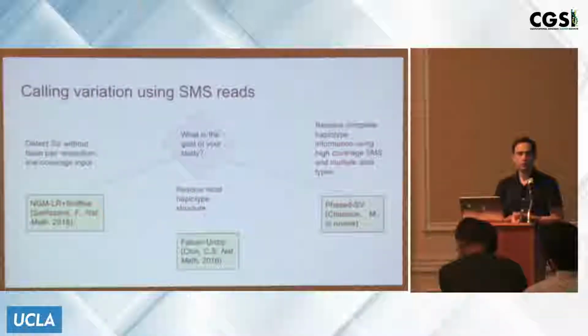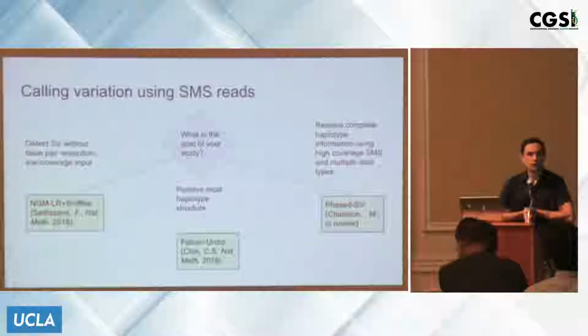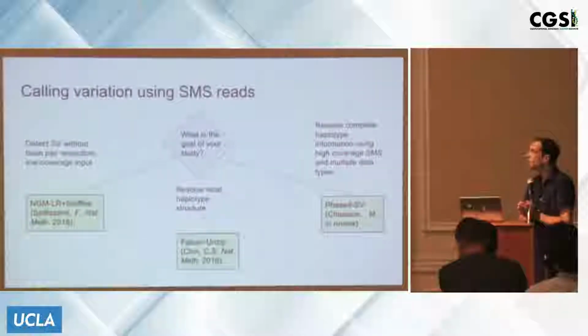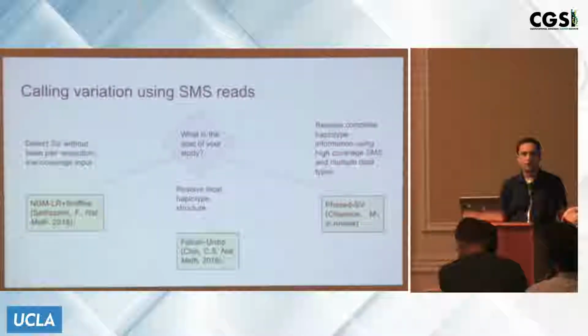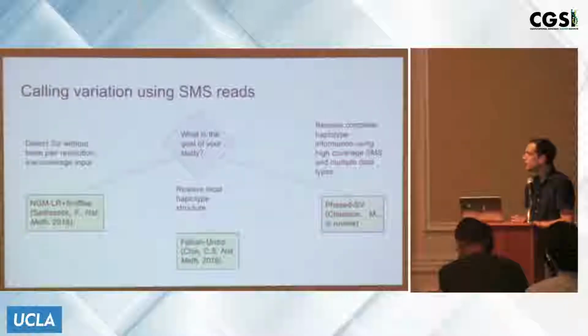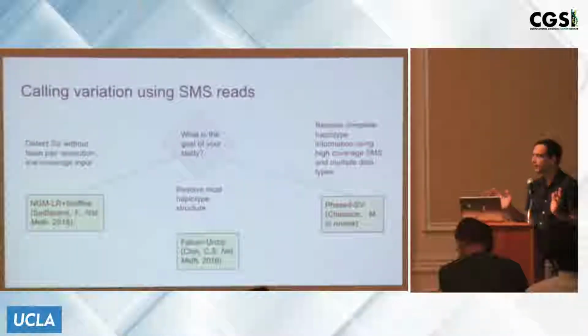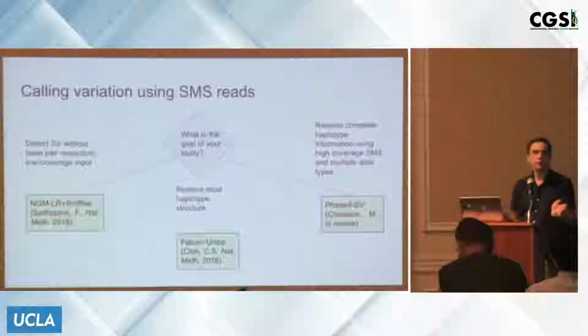Okay, so that part is just discussing methods for doing read mapping. And you kind of think of this, if you are going to be detecting structural variation using alignment, that's the first step that you're going to have to do. Nowadays, the Minimap aligner is so fast and pretty accurate, it's hard to really recommend doing anything else.